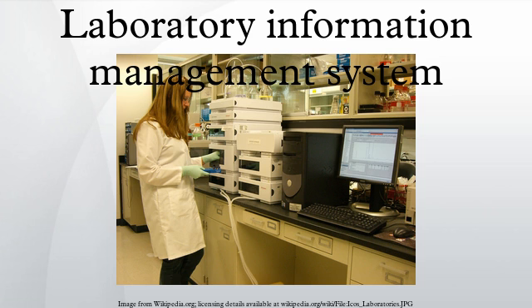A LIS, however, must satisfy the reporting and auditing needs of health service agencies, for example the Hospital Accreditation Agency, HIPAA in the U.S., or other clinical medical practitioners. A LIMS is most competitive in group-centric settings that often deal with mostly anonymous research-specific laboratory data, whereas a LIS is usually most competitive in patient-centric settings and clinical labs.